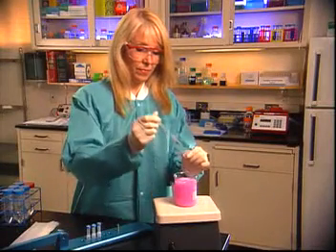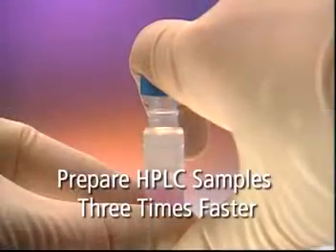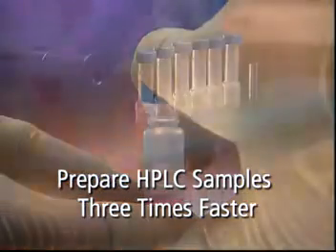The Wattman Mini-Uniprep Syringeless Filter provides the fastest, easiest method for HPLC sample preparation.